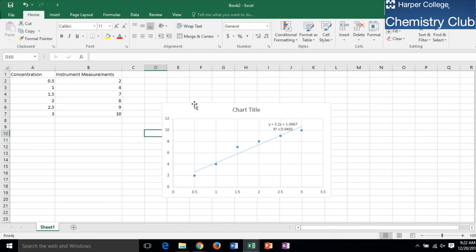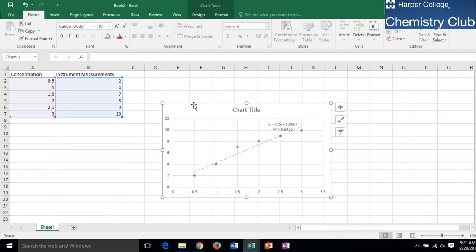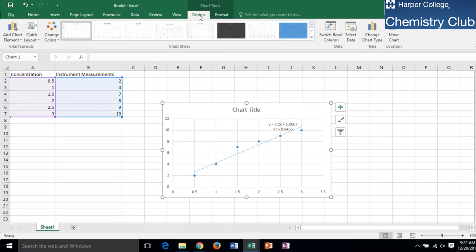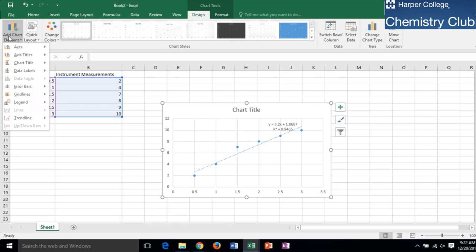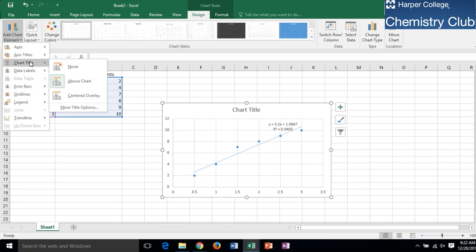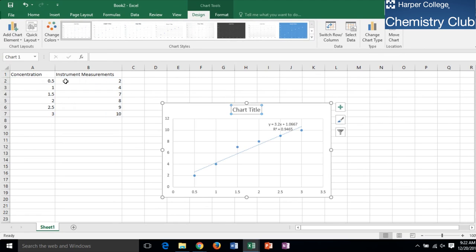Click on the graph and select it. At the top of the screen, two tabs will appear that are grouped under Chart Tools. Select Design. Click Add Chart Element, followed by Chart Title. Then choose Above Chart. You can now click inside the text box that appears and title your graph.